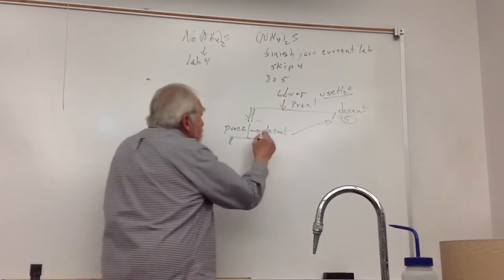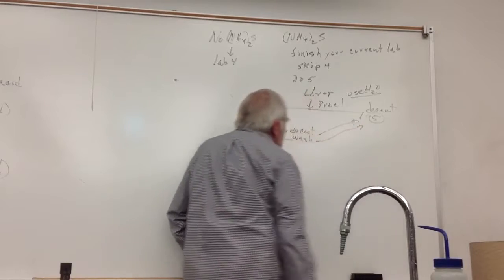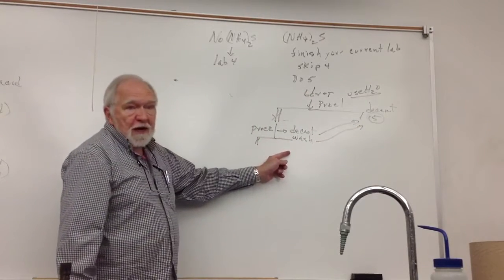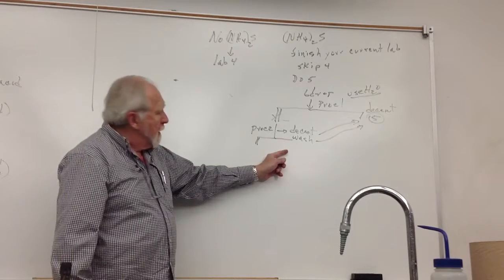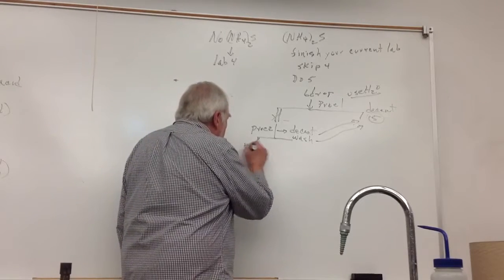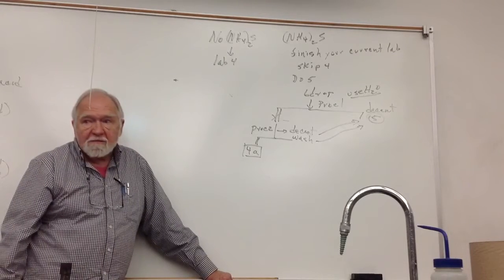The washings from procedure 2 go into this test tube. That means there's nothing to do in procedure 3, because procedure 3 is where you do the decantate. So all you're doing is 4, looking for mercury 1 and silver.